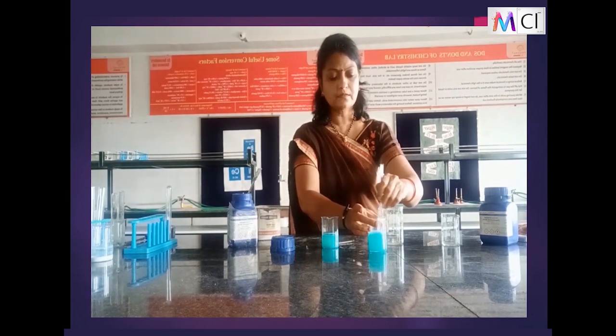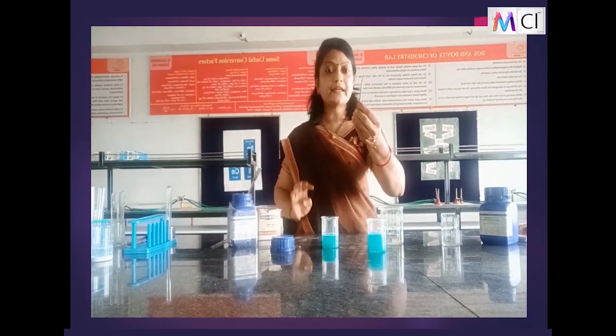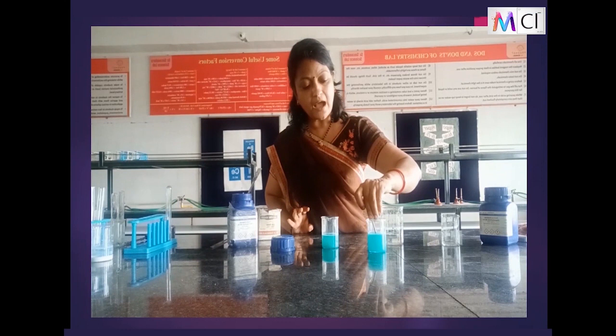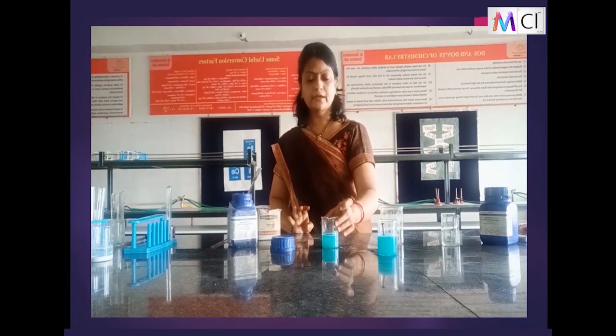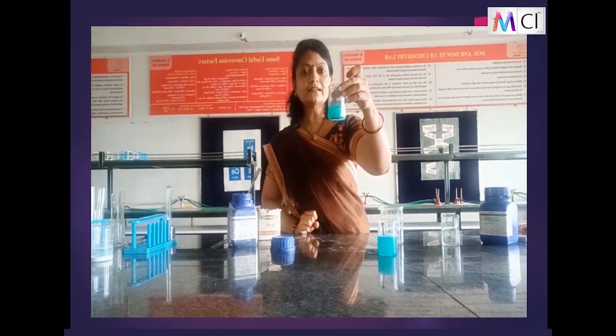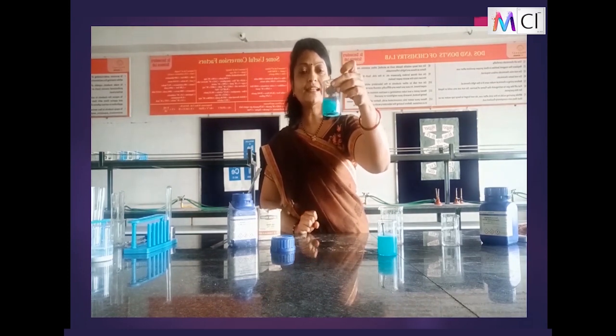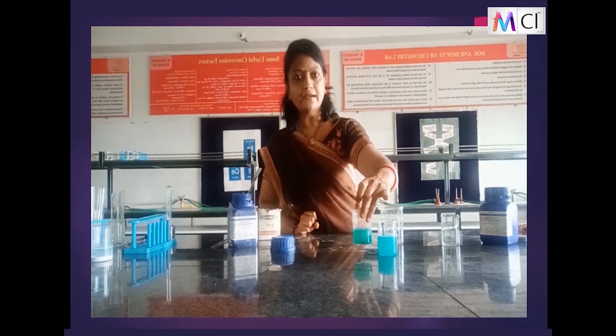So here there is a copper sulfate solution ready. This is the iron nail, and I'll just dip the iron nail and we will wait for the reaction to take place. Okay, here we had already added iron filings. Let us see. Can you observe, children? Slightly the color is changing, isn't it? Observe blue and this is greenish.